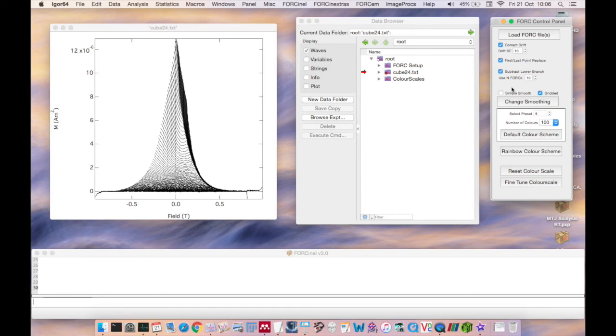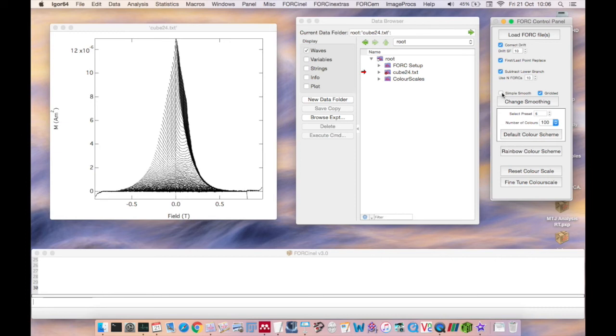Now to smooth the data. Smoothing in ForkNL3 is based on Ramon Egli's variable smoothing or varifork algorithm. However, you also have the choice to restrict the varifork smoothing algorithm to a single constant smoothing factor. To choose this simpler approach click the simple smooth checkbox before clicking the change smoothing button.